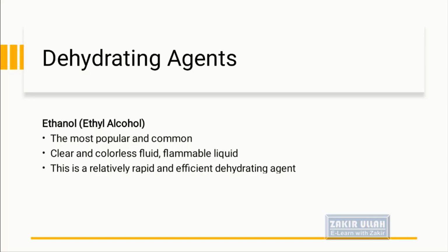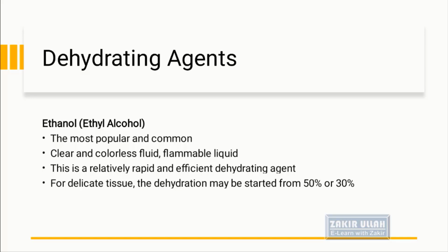However, sometimes it is difficult to purchase from the local market because a government license is needed to buy alcohol for laboratory purposes. For delicate tissues, dehydration may be started from 50% or even 30%, and then the concentration of the alcohol is increased.